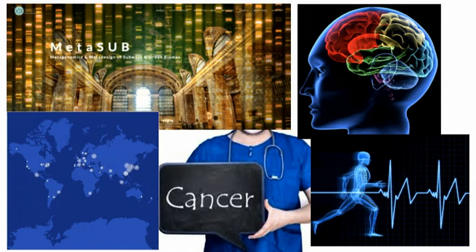So the lab looks at a wide diversity of projects, from physiological measurements for performance, neurological disease, cancer, and then some more global population efforts. There are also some projects that I'm sure you'll hear about in the keynote, as well as many people in the room and at the meeting, I've worked on with Chris Mason, the MetaSUB project. We've done quite a bit of sequencing for that.